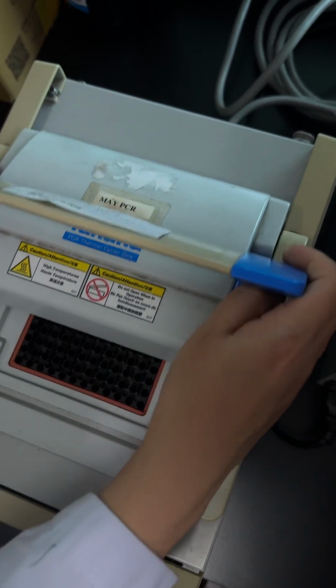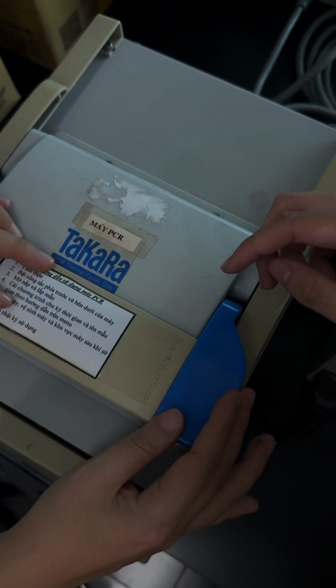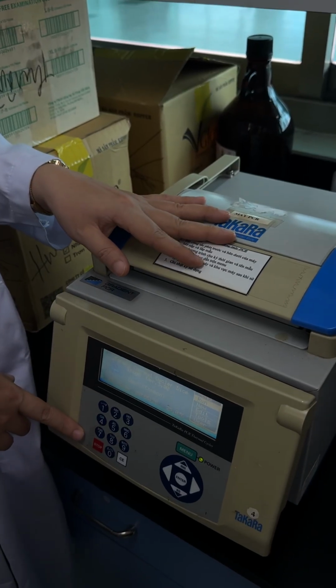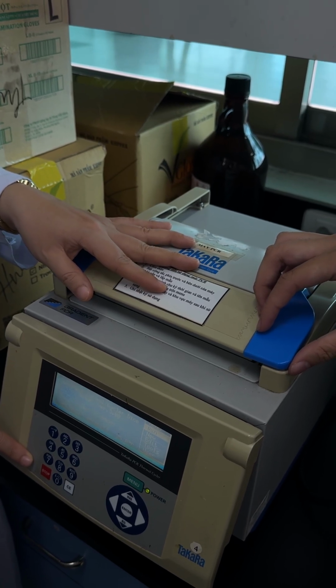If it is running, you need to hit stop. There will be no cancel button here. You need to hit stop so it will stop the run. If you stop it, does it continue? I think it will start from the beginning.